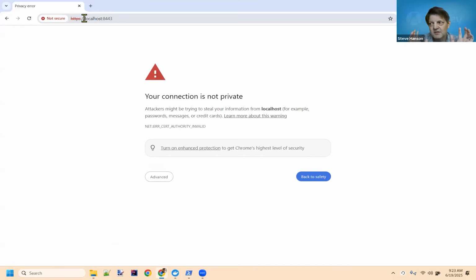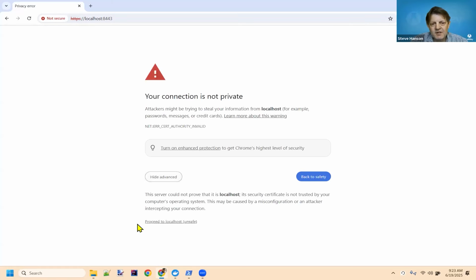And Chrome is just telling us, you realize that's a self-signed certificate. Do you trust it? Well, you can trust it. This is actually safe. It's also just on my laptop. But getting past these kinds of screens is exactly the kind of expertise you need to move this to a production environment. Again, that's for another day. But I'm going to tell Chrome, yes, I know what I'm doing. I know this is a self-signed certificate. I want to go on.